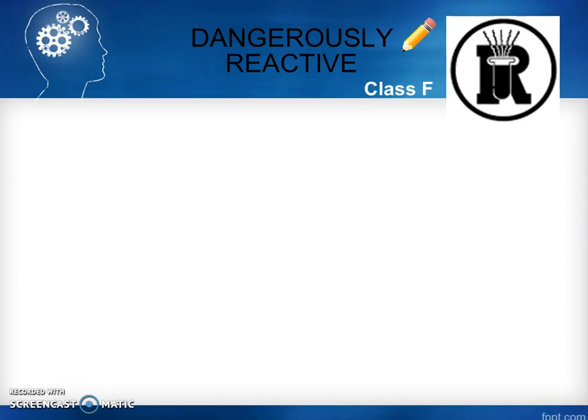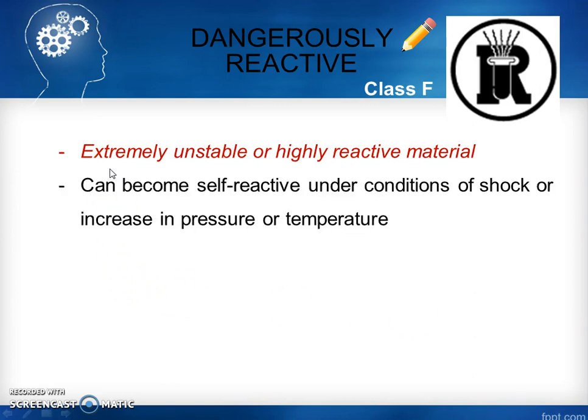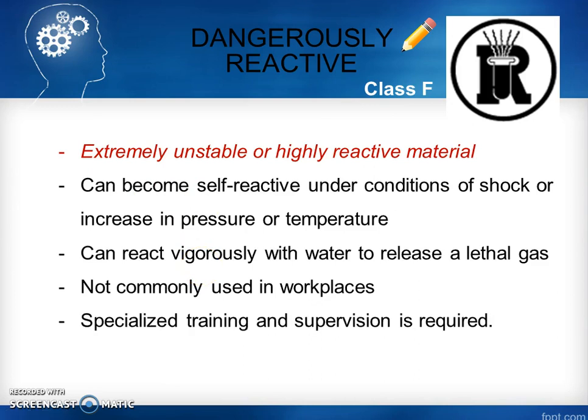Okay, Class F, dangerously reactive. Now these guys are extremely unstable or highly reactive material. They can become self-reactive under conditions of shock or increased pressure or temperature. So they're not common in the workplace because of these reactions. They need to be handled with special training or supervision is required. So you don't really see these that often. And if you do, be aware that they're very dangerous.